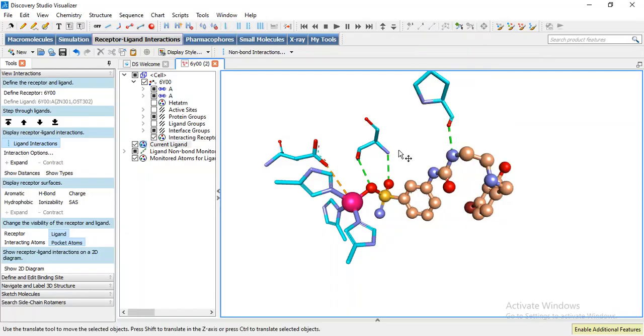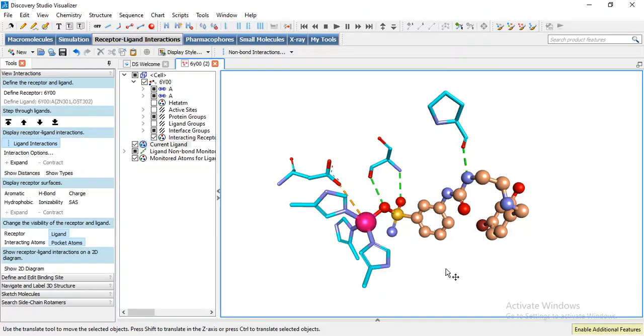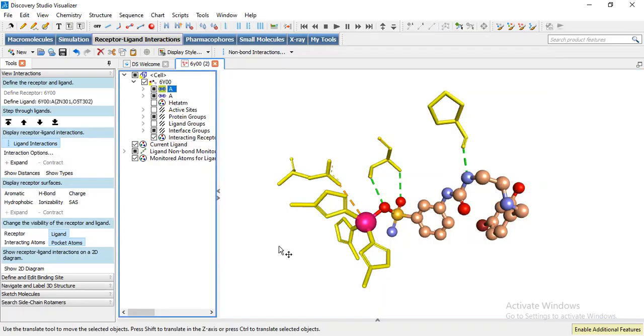Now I am going to label so we can select what I want to label these residues.